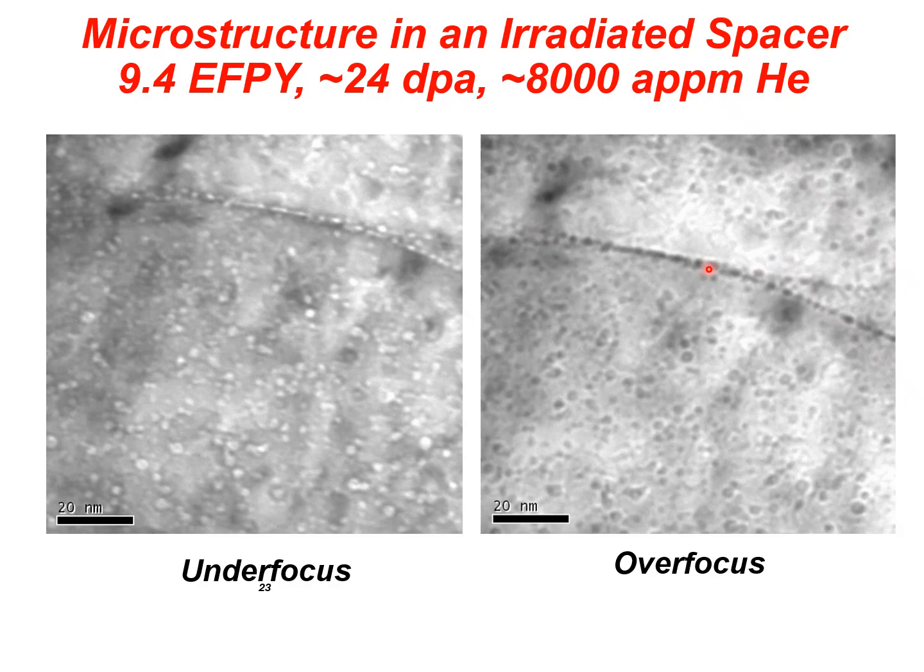I mean, you can deduce that they're higher concentration because the density is higher. So you can deduce that you have a higher planar density of cavities, comparing this to this. But that's just reasoning. Even then, you want to be absolutely sure using stereo microscopy that they're in the foil.